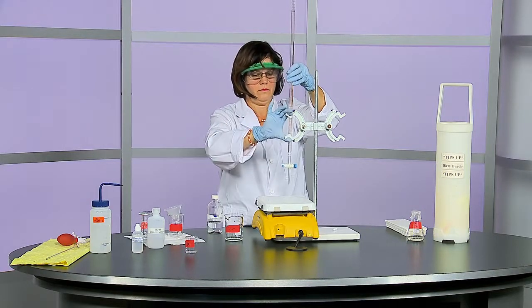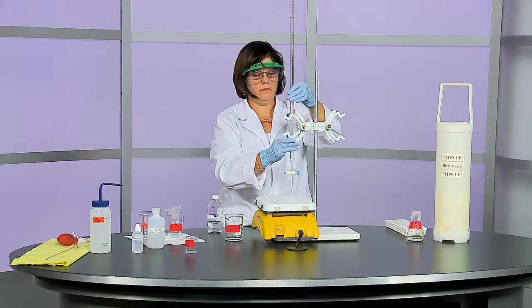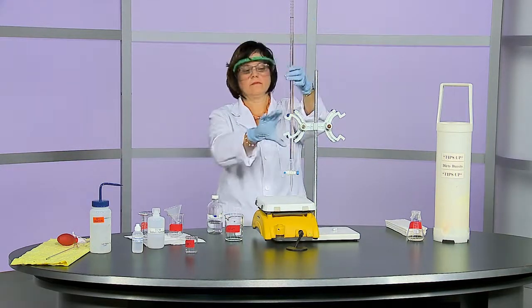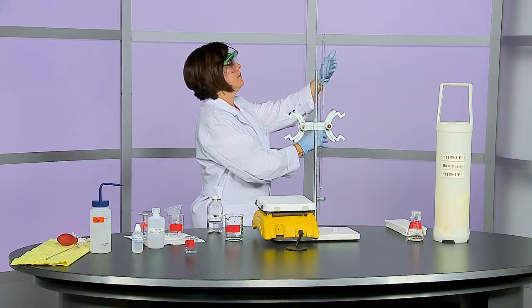Don't waste time getting the meniscus exactly at 0. It just needs to be within the graduations. Read and record the value to 2 decimal places. Make sure you are at eye level when reading the meniscus.